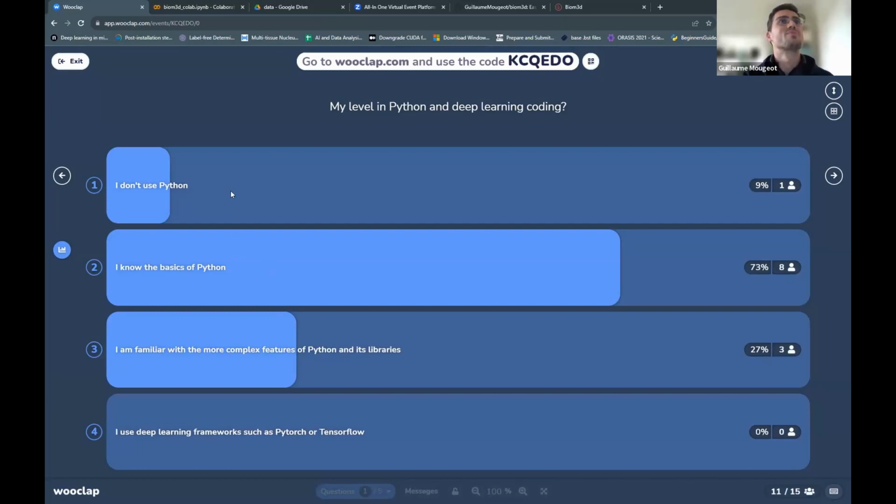Welcome. I will skip certain very basic things, but I will stay very basic on programming, so you will be able to follow along. For those who would like to discover more complex features, I'll present the documentation and everything in this talk. So let's start.